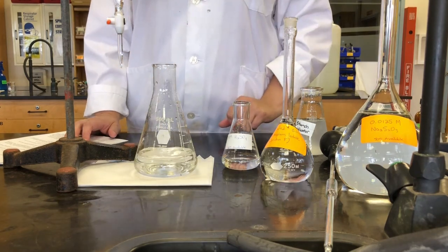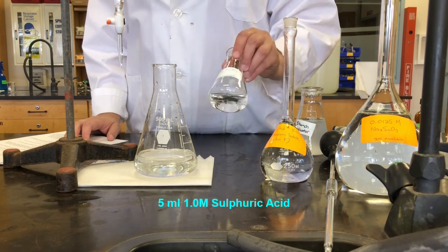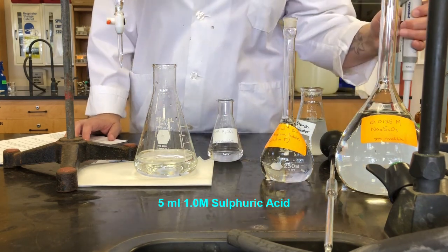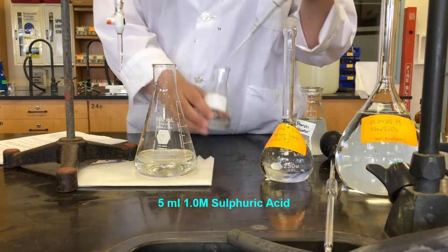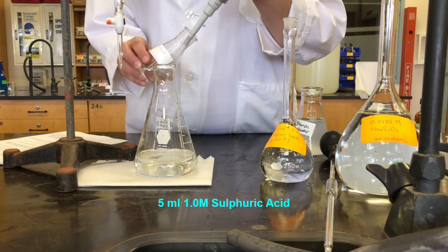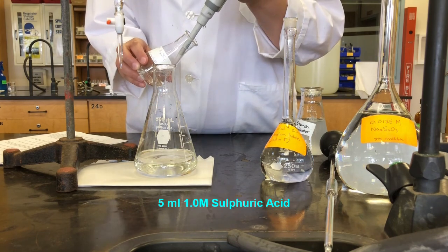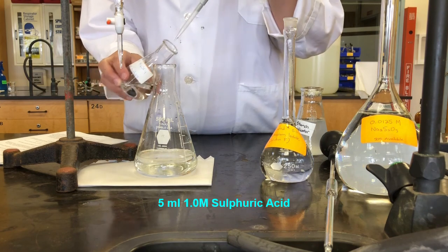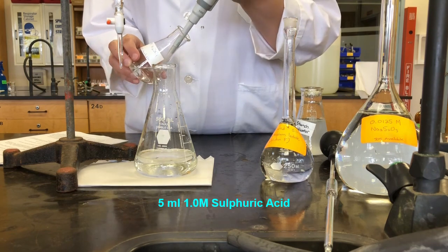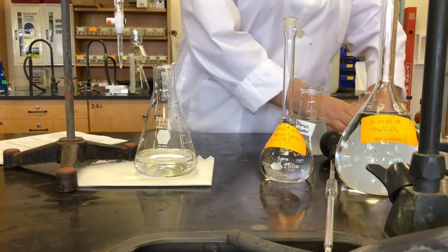Now we want to acidify it, so we're going to add sulfuric acid to it. So this is solution H. It's 1 molar sulfuric acid. So we're going to add 5 milliliters of sulfuric acid to the flask. So I'm going to use an Eppendorf pipette for that. So this Eppendorf pipette is set to 1,000 microliters, which is 1 milliliter. So we're going to do that 5 times. We could also use a regular volumetric pipette for this as well, but Eppendorf is just as accurate as that. So that's our 5 milliliters.